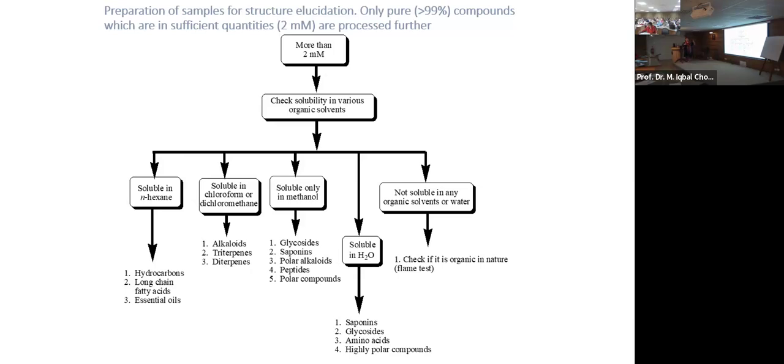Think about it: you are taking 1 or 2 milligrams of your sample and 0.5 ml of solvent. Between solute and solvent, which one is higher? Solvent.